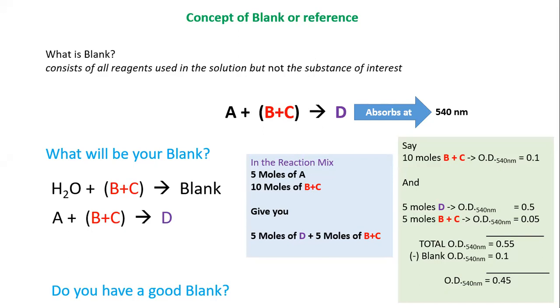So does that mean that the blank that you prepare and the zero that you adjust by using that blank always has some degree of error in it, and you have to live with that error? The problem actually crops up more when you are decreasing the concentration of the compound of your interest.